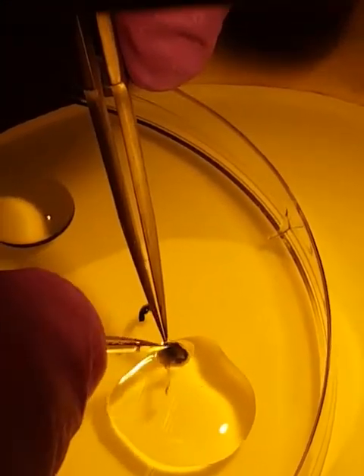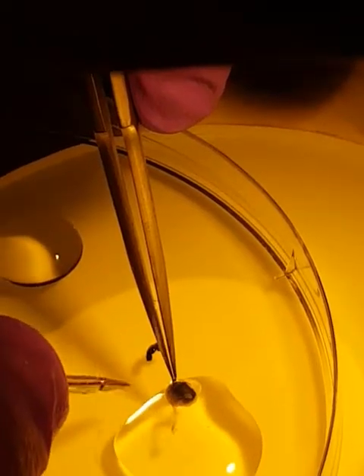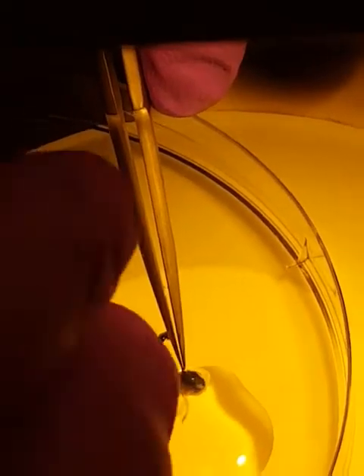All the places where the cilia is attached to the retina, we have to cut it.